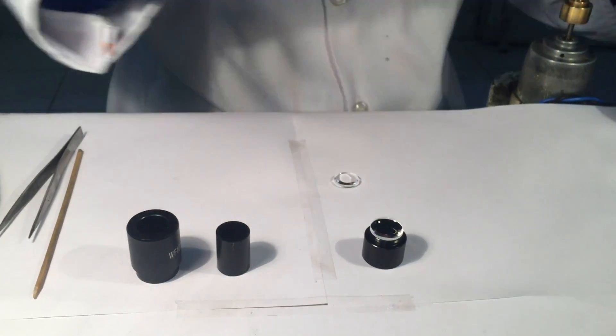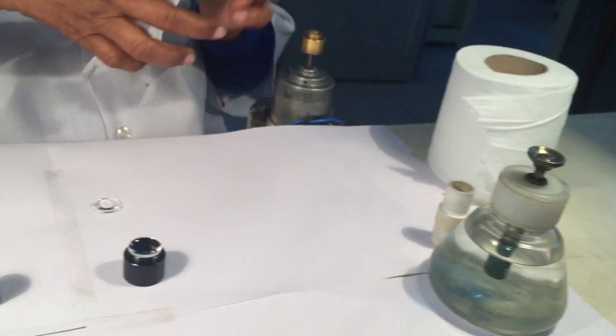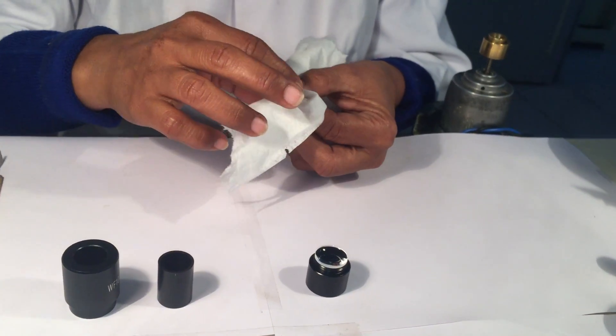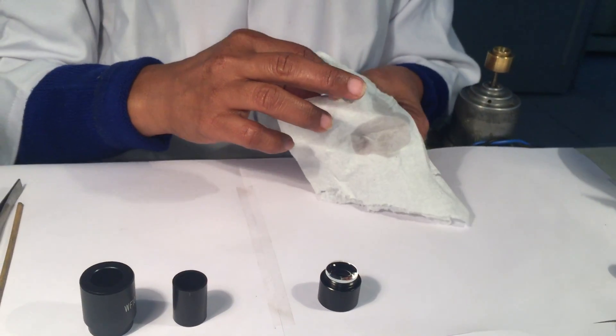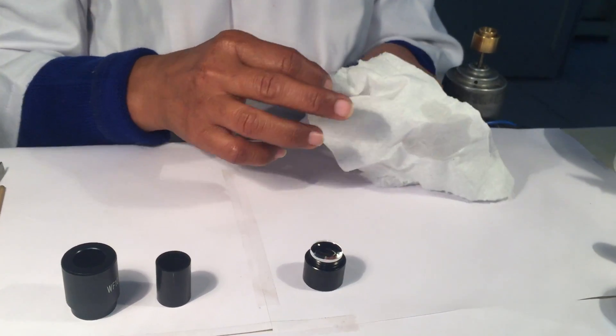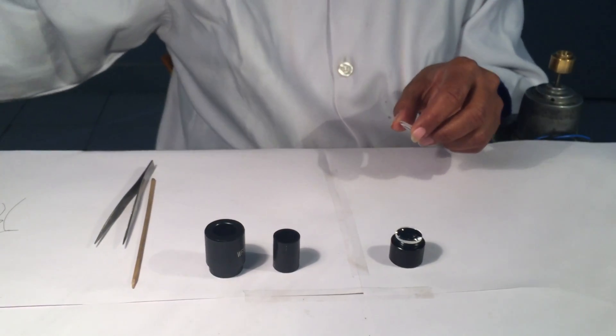So we will take the eye lens now. Same process, we will take a dry tissue paper, dip it with spirit and clean the surface of the lens. And then wipe it properly with the dry part of the tissue paper. Then air blow the same.